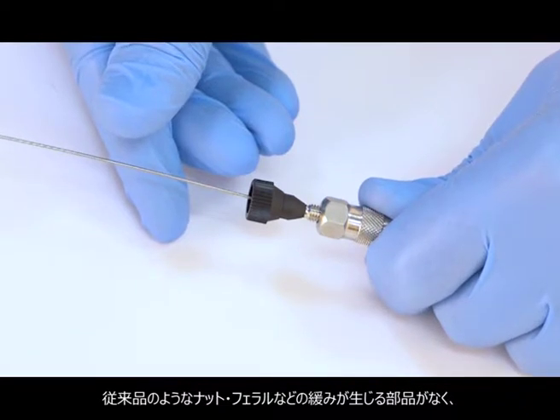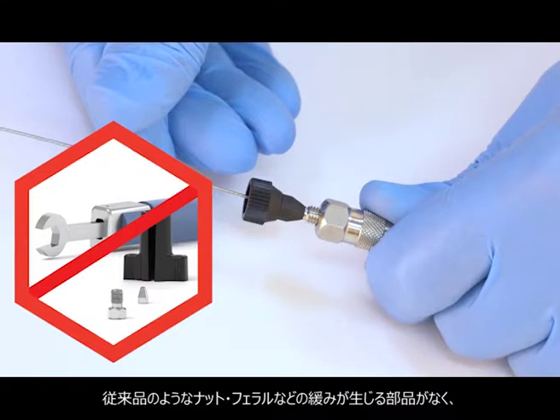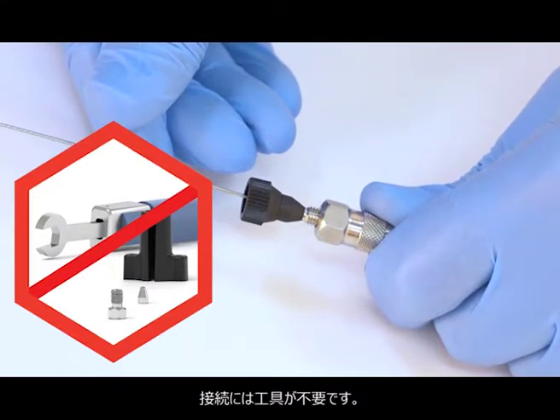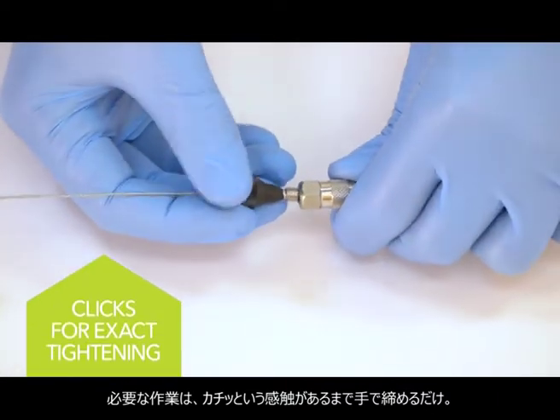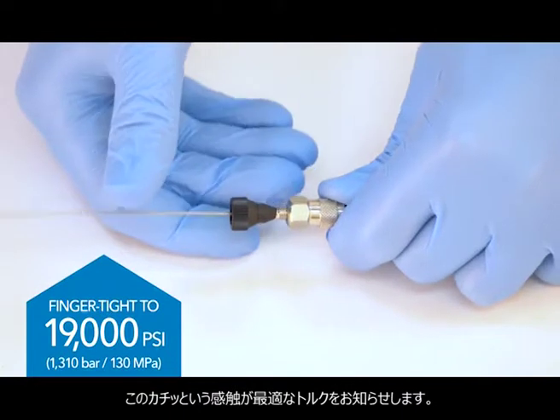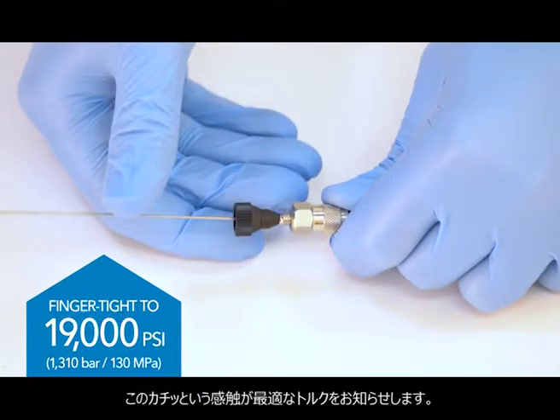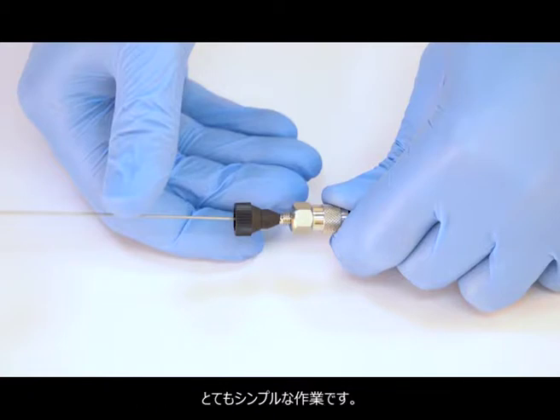Marvel Exact eliminates struggles with loose components as seen with other fittings on the market. It has no loose components such as nuts or ferrules, and it requires no tools. All you need to do is finger tighten until the first click feedback is received. This click feedback confirms optimum torque has been reached and installation is complete. It is that simple.